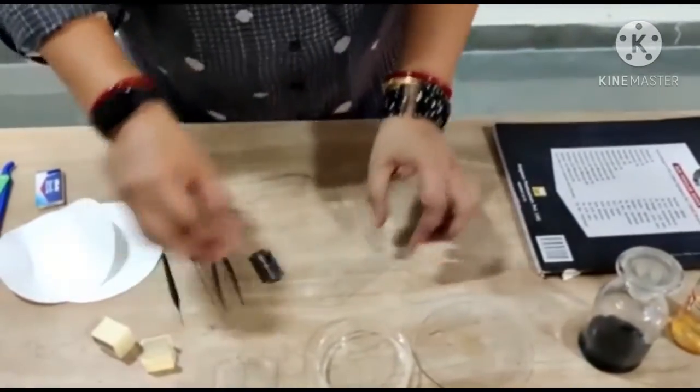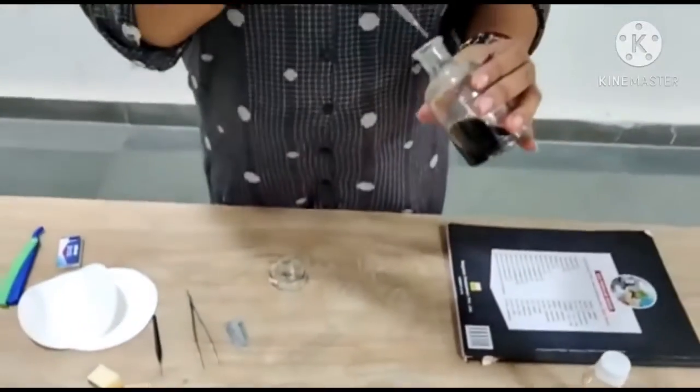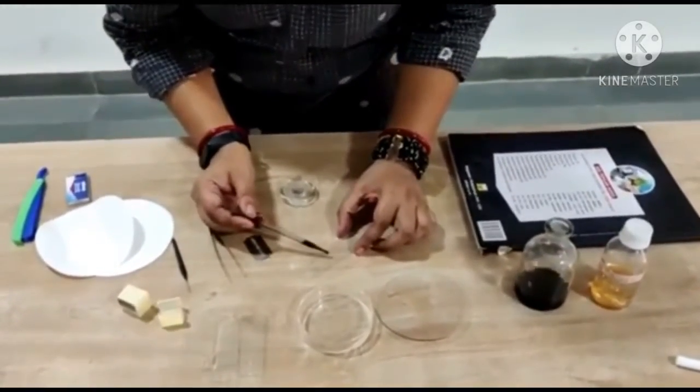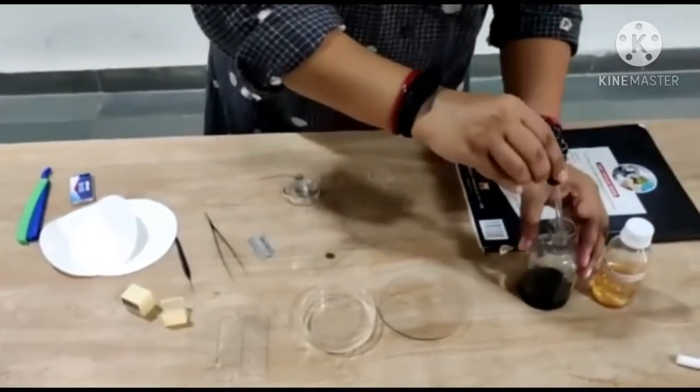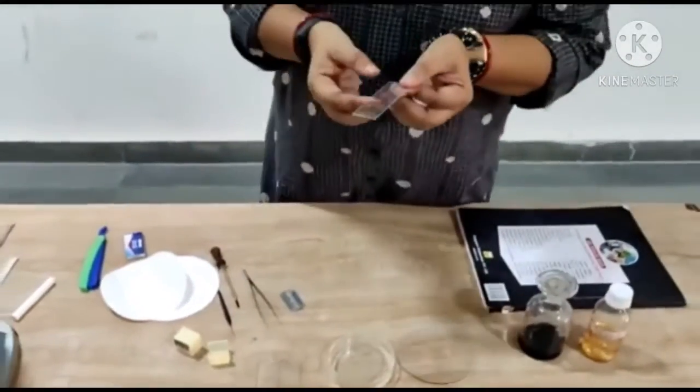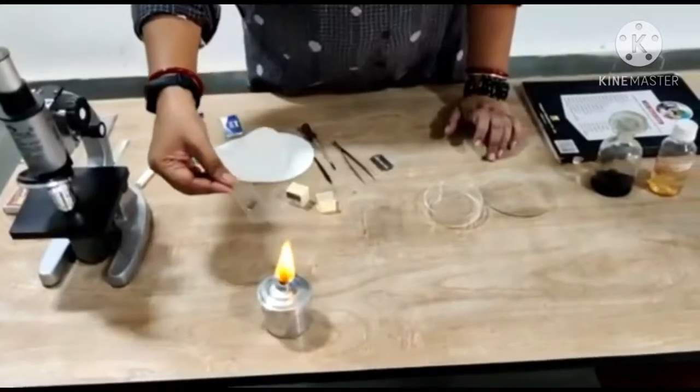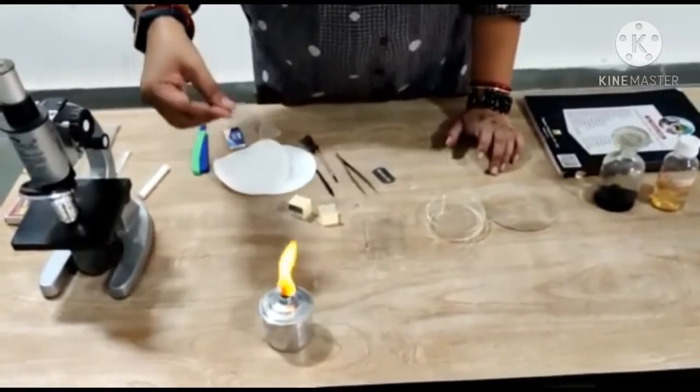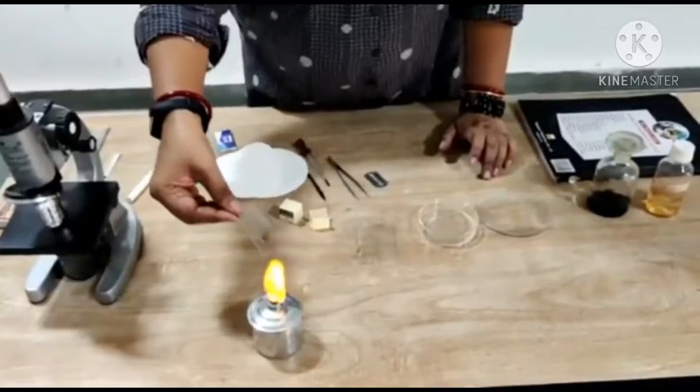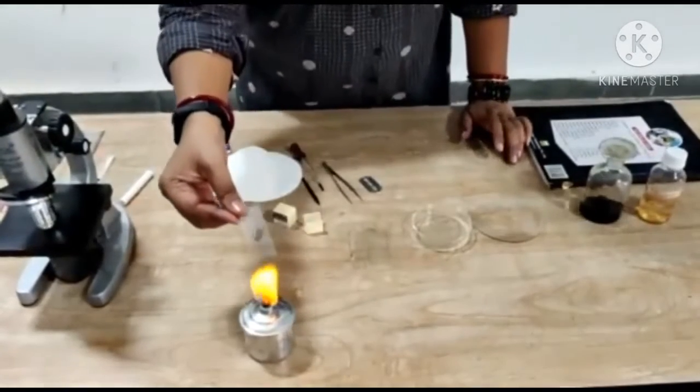Now, we will put two drops of stain in it. This is the acetocarmine stain, which is used for staining of nucleus and chromosomes. Put the stain carefully. After putting the stain, we will warm the slide by keeping it over the spirit lamp. Do not heat the slide, just intermittently warm it. Why is warming necessary? It is necessary to fix the dividing cells at some stage.